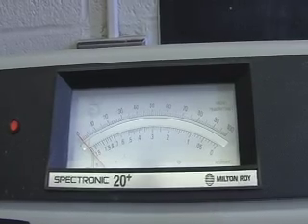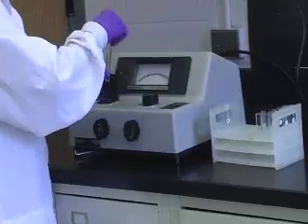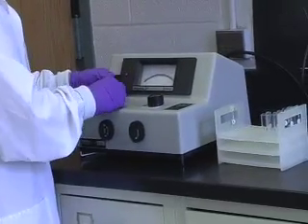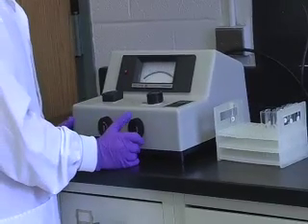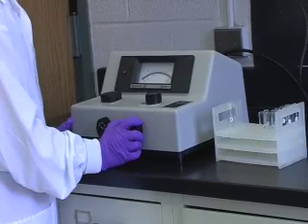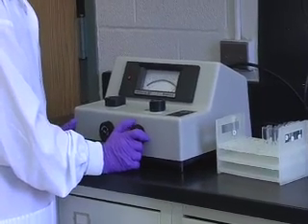Insert a cuvette with at least 3 ml of water into the sample chamber. Push it down until it stops and you hear a click. Close the sample cover. Use the right front knob to bring the needle to the 100% transmittance or zero absorbance line at the right of the scale. This blanks the spectrophotometer.